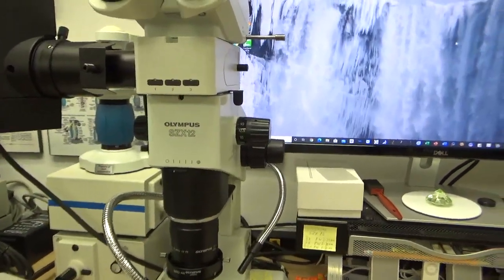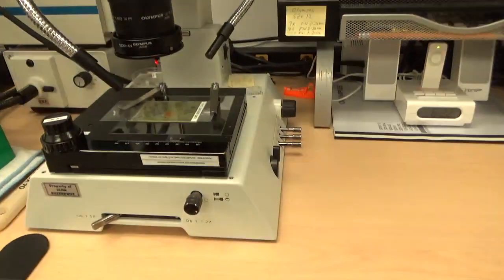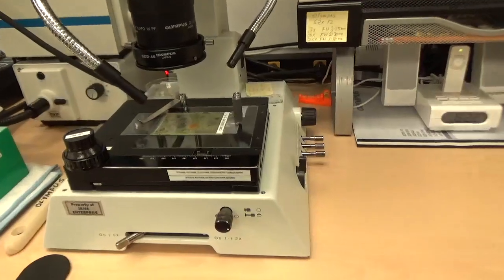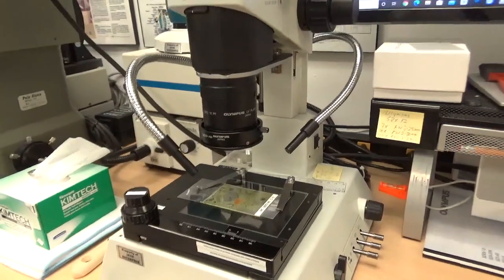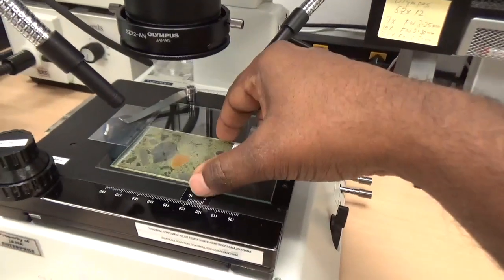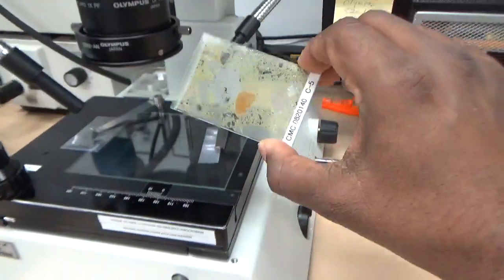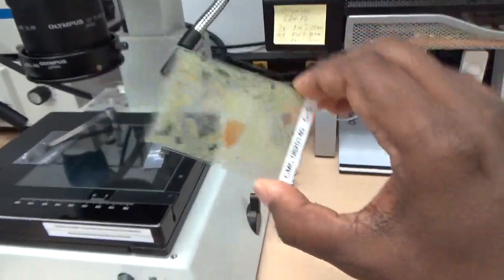We use an Olympus SZX stereozoom microscope, which has transmitted light, reflected light, and fluorescent light attachments. We use the transmitted light base, the transmitted light mode, to do the scanning of the thin section. Here is a thin section of concrete impregnated with a fluorescent dye mixed epoxy. I'm going to show you how to scan this thin section. It's a 50 millimeter by 75 millimeter, 2 by 3 inch size thin section.